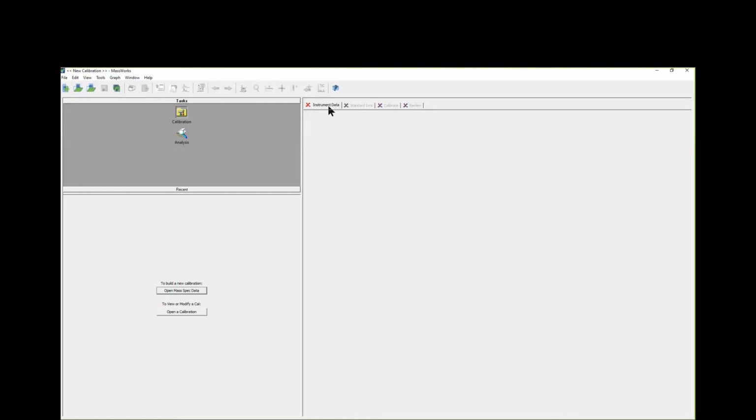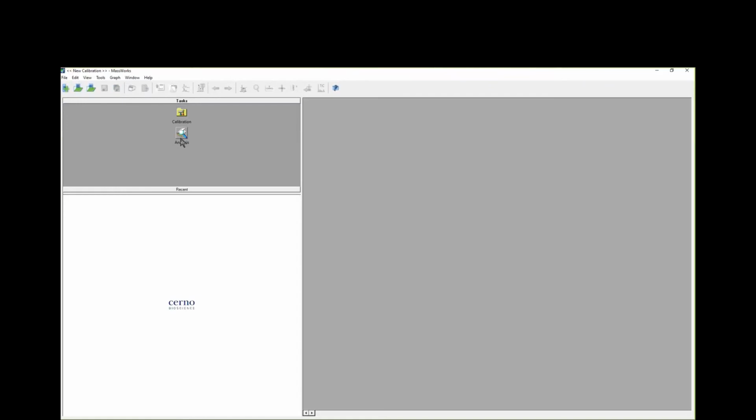We can go back at the end if you're interested, how you would build one manually, because like I said, you probably will never use this.